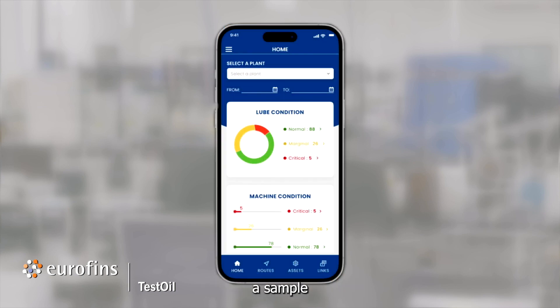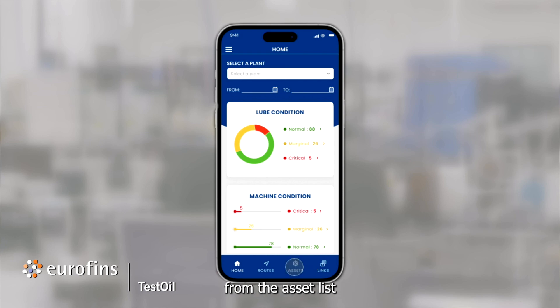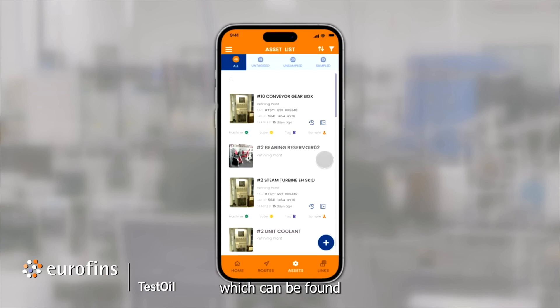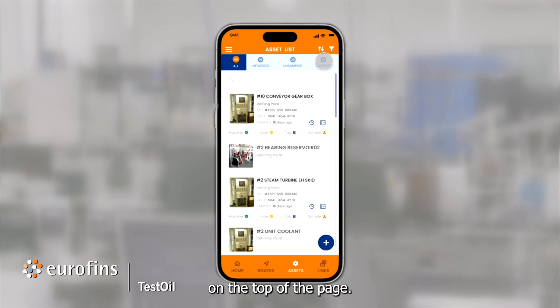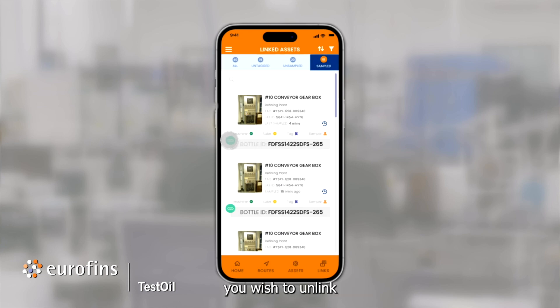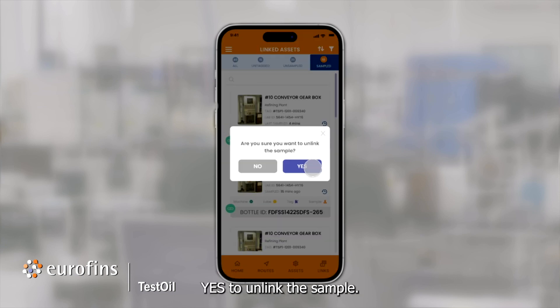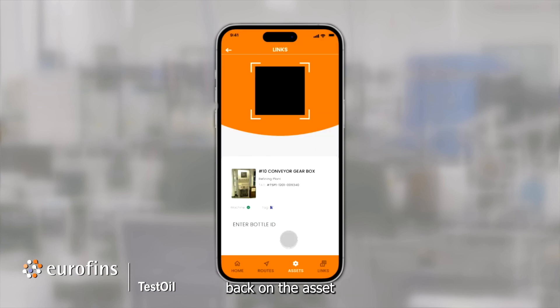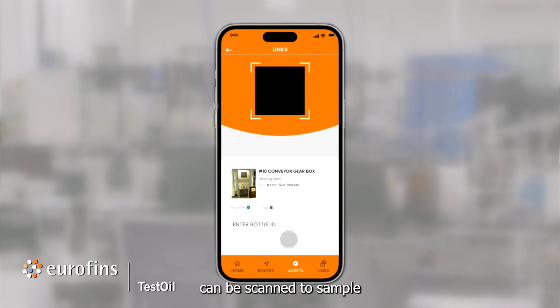If you would like to unlink a sample from an equipment asset, select that sampled asset from the asset list, which can be found using the Sampled filter on the top of the page. Select the green chain link icon next to the sampled asset you wish to unlink, and simply click Yes to unlink the sample. From here, we arrive back on the asset linking page, where a new bottle can be scanned to sample this equipment asset.